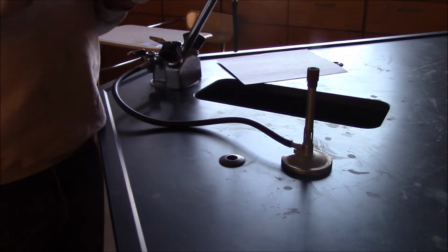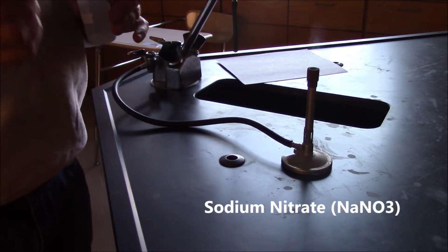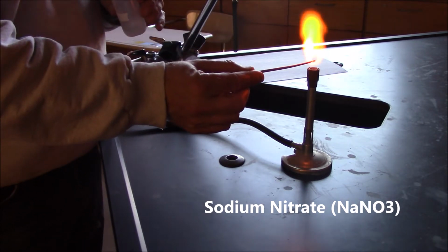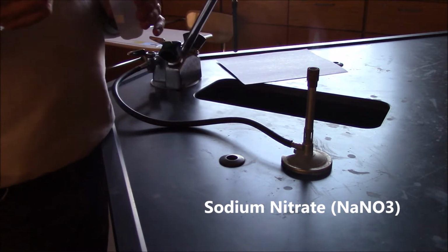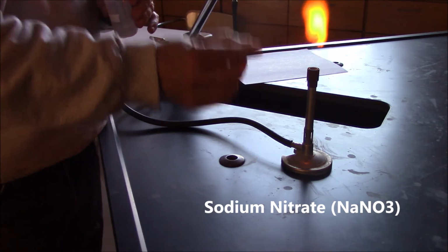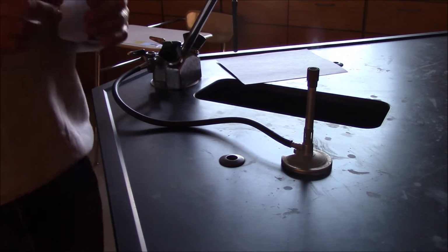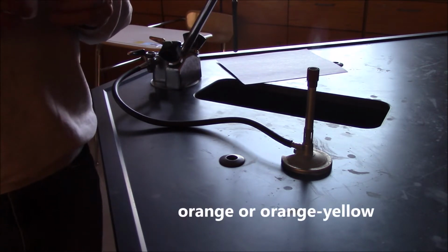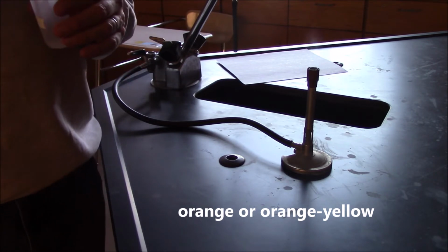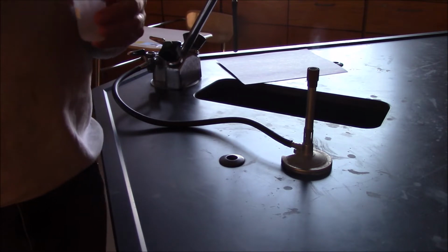So the first one, and I'll do these in the order that they appear on the worksheet, is sodium nitrate. I'm going to stick a wooden splint that's been soaked in sodium nitrate solution in, and there's our flame color. Okay, I'll do it again. You can write down any way you want the color. I keep it to orange, orange-yellow. If you want to pretend you work for the J. Crew catalog and call it clementine or tangerine, you go right ahead.